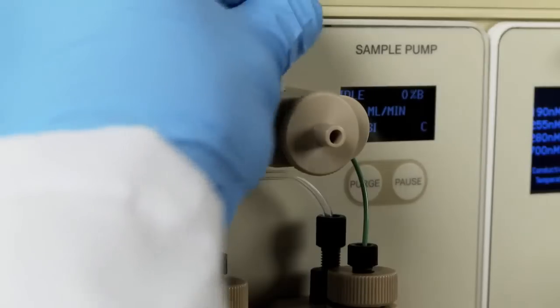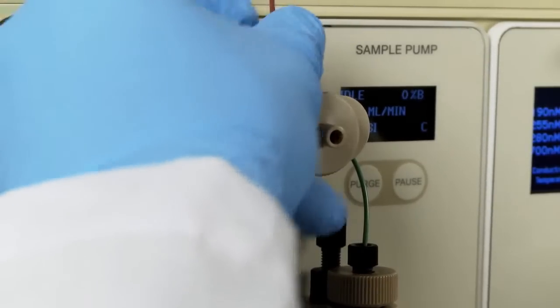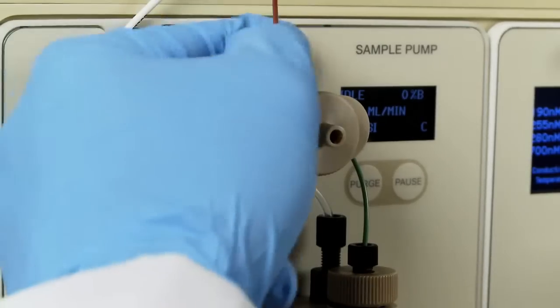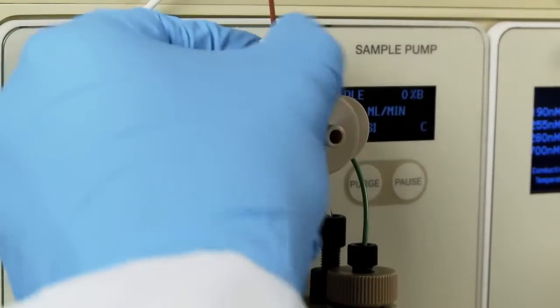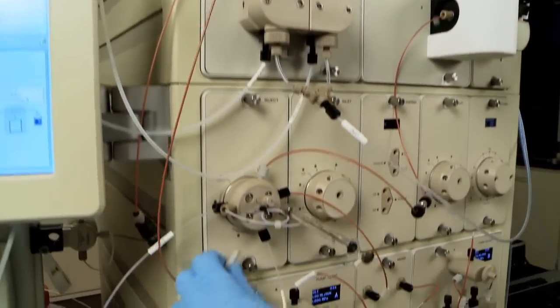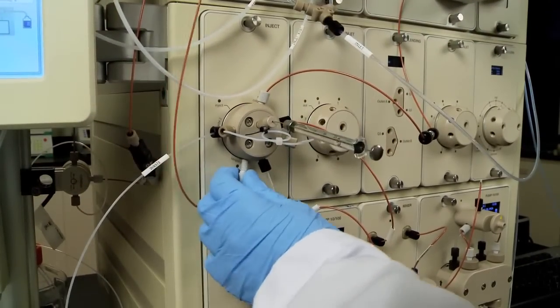Now you will attach peak tubing from the sample pump to the injection valve. First, connect the tubing to the outlet port of the sample pump manifold. Now attach that line to the sample pump inlet of the injection valve.